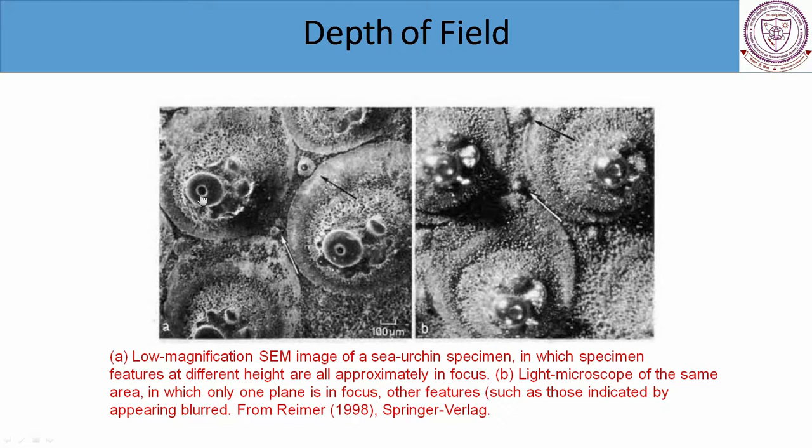It is this depth of field which is of prime importance in the characterization of materials, particularly fracture. Whenever there is a fracture piece, that means the specimen has failed in tension or in compression or under any other stress condition, if you look at the fracture surface, you find that this depth of field gives a lot of advantage in interpreting the result, and you are able to predict what kind of fracture it has.